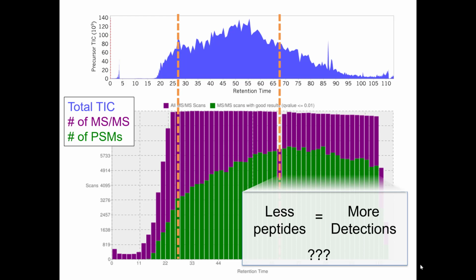A lot of the signal is just at that threshold where you're just going to scan over the surface of it with the DDA method, right, where it's just never going to be able to pick the stuff at the low graphs. Here, it's going to stand a much better chance because there just aren't that many species at that level in the chromatogram. Okay?